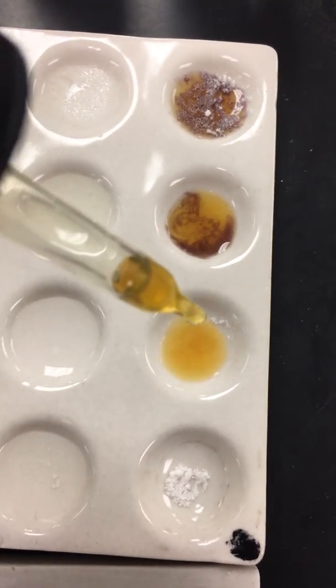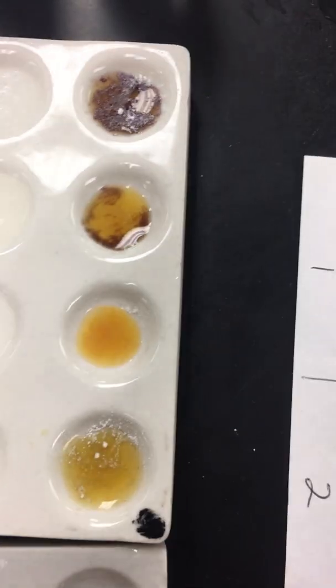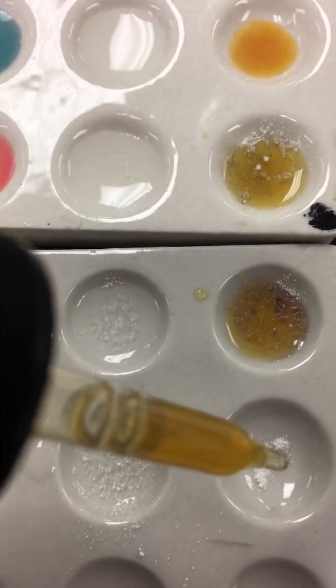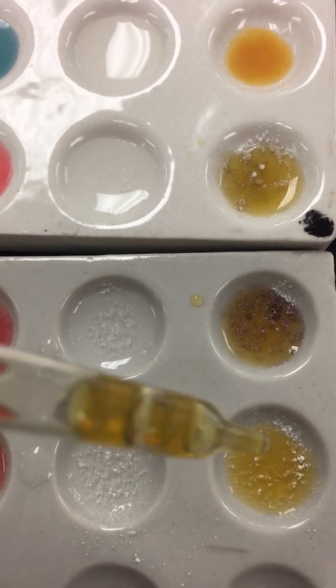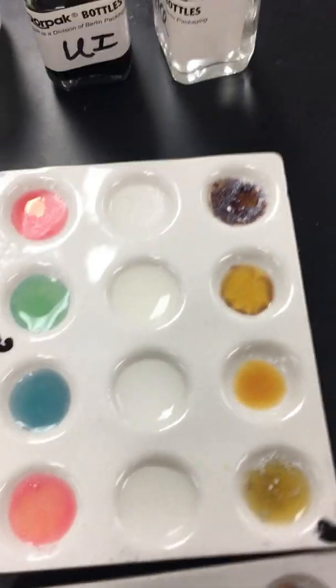Just kind of turning these, some purple, some staying orange. The solution itself, iron chloride, is orange. That's orange mixed with some purple. It's kind of orange. So let's take our toothpicks again.